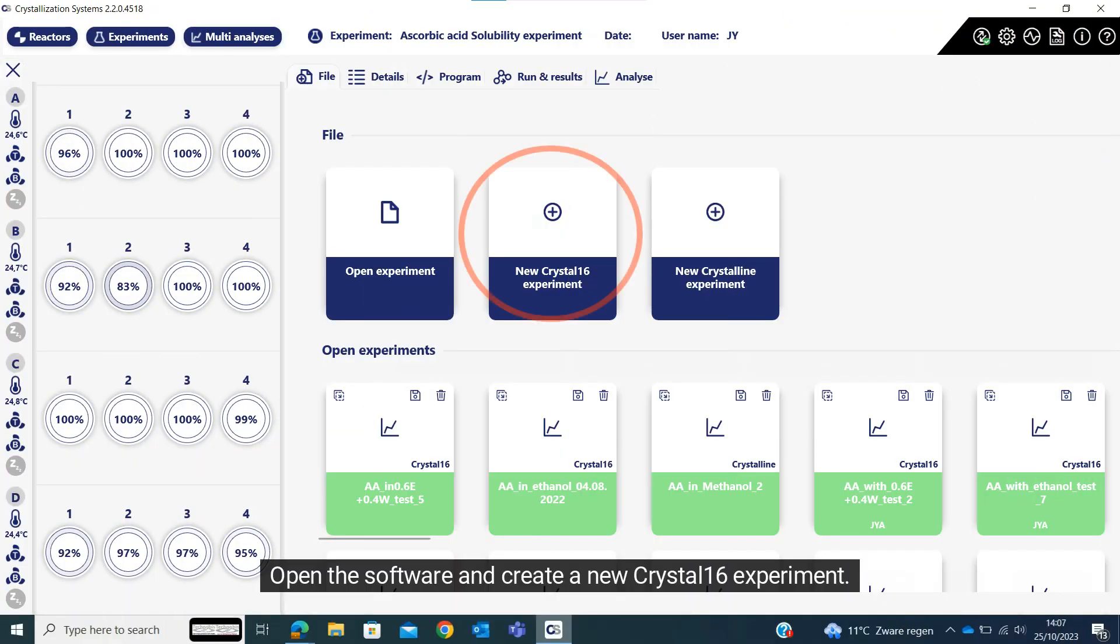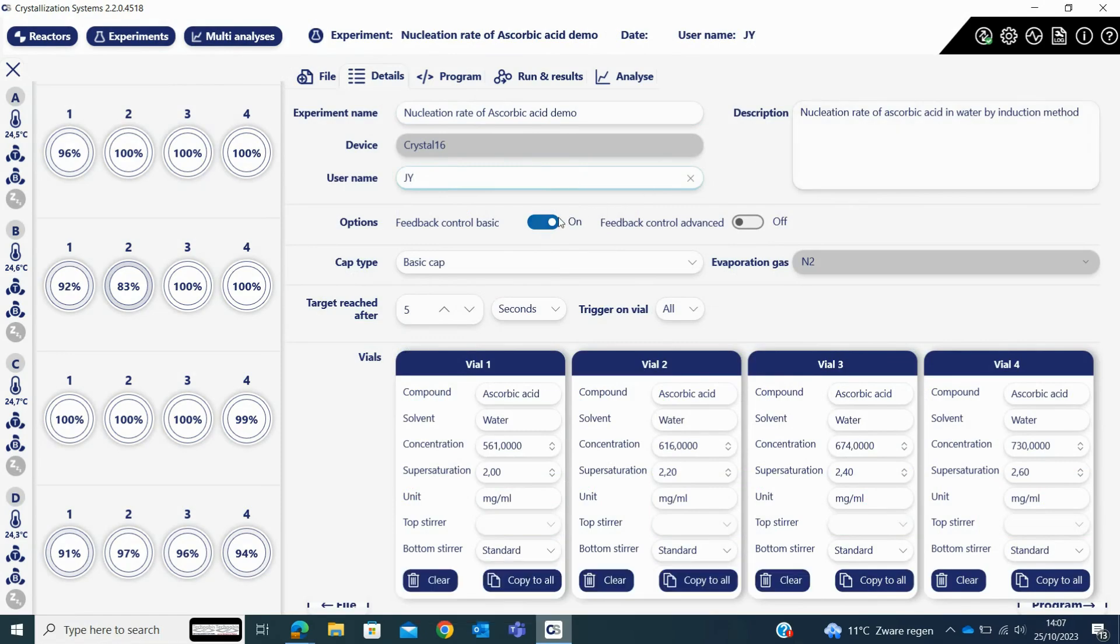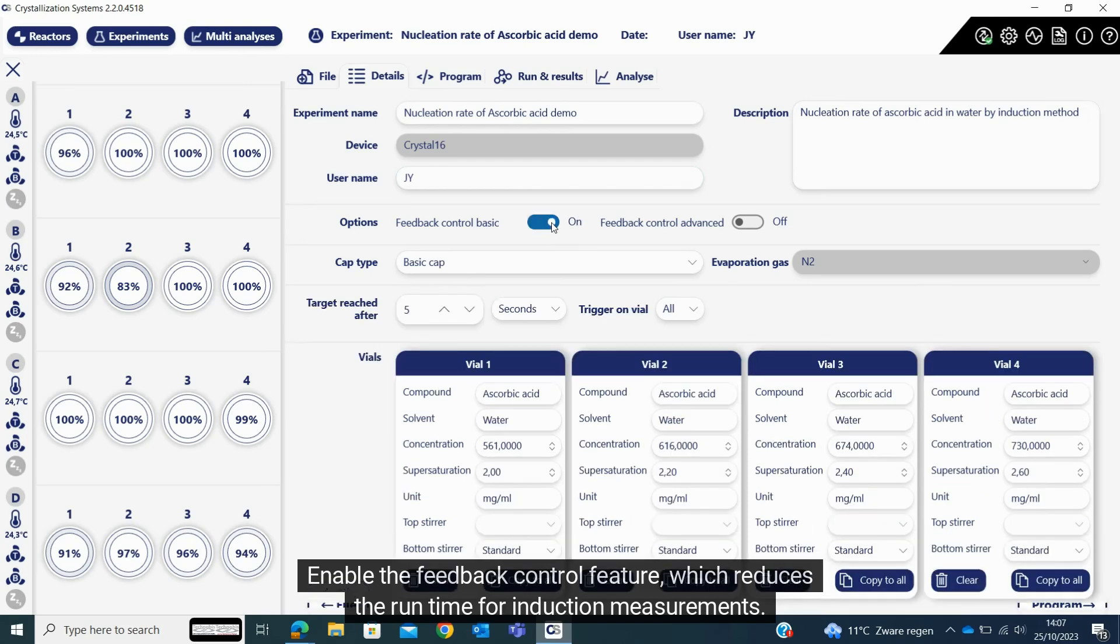Open the software and create a new CRYSTAL16 experiment. Fill in the experiment details like experiment name, user name, and description. Enable the feedback control feature, which reduces the run time for induction measurements.